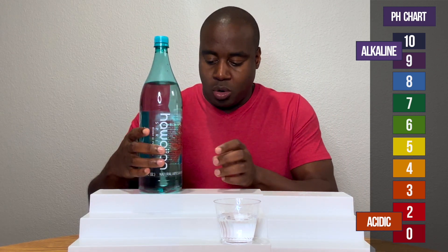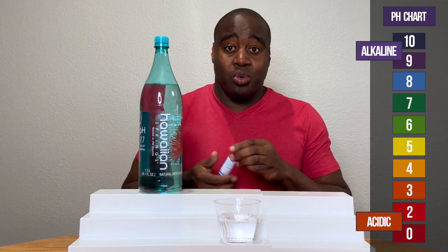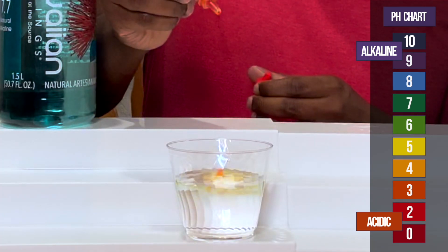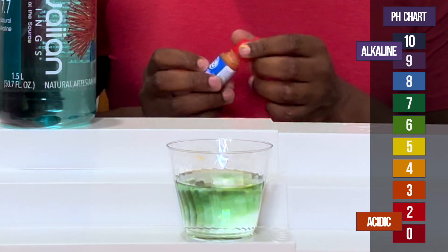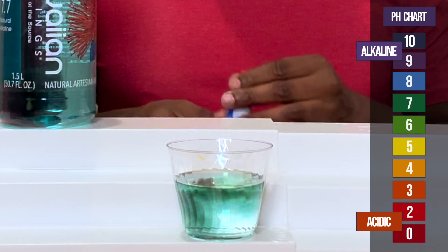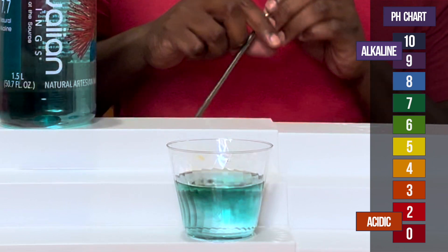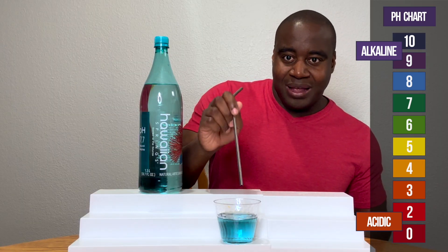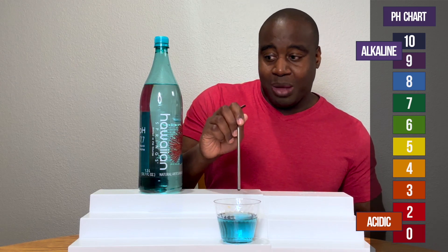So let's see what we get here with Hawaiian springs. Ooh, look at that. Looking like a set between a 7 and an 8. Let me know what y'all think in the comments, what you see.